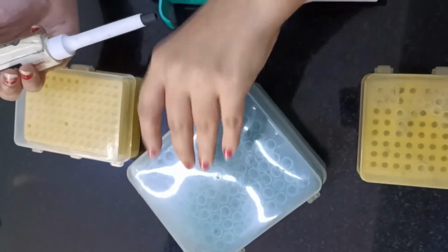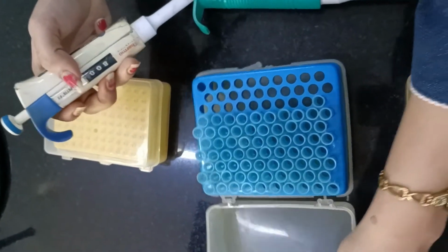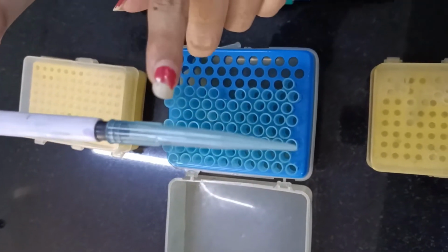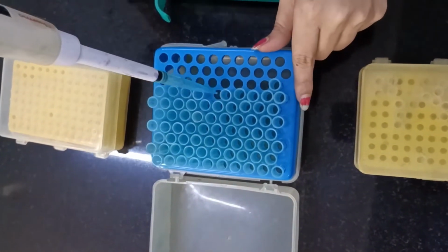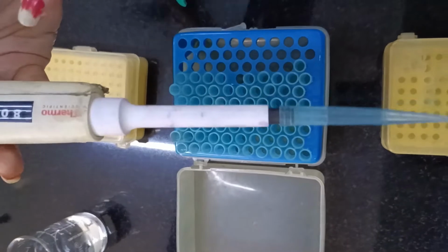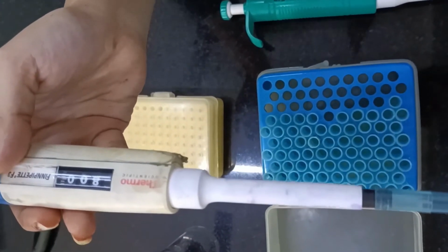Firstly, I will place the micro tip onto the micropipette. This is the holder where micro tips are kept in place. So I am going to place a micro tip onto this micropipette. Now as I have set it at 800 microliter, it is going to pick up the volume that is 800 microliter only, not above it, not below it.